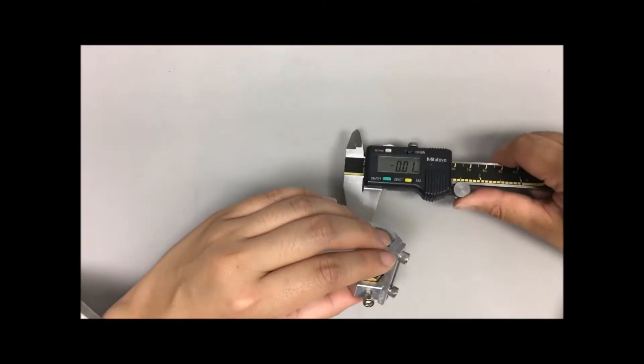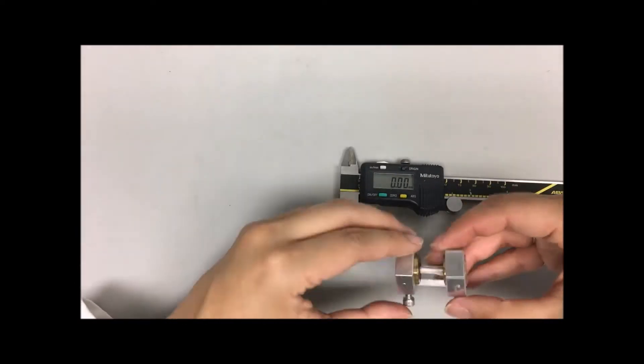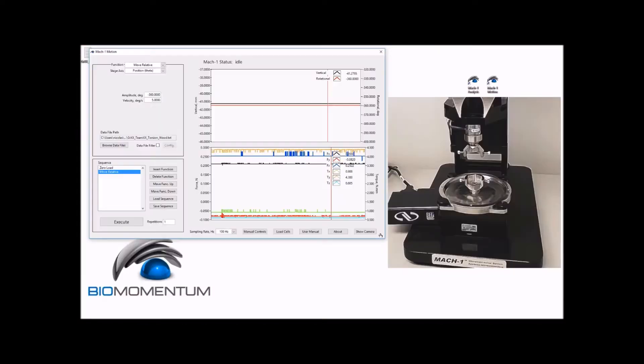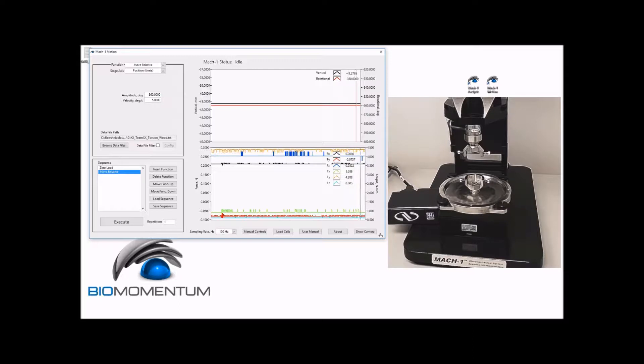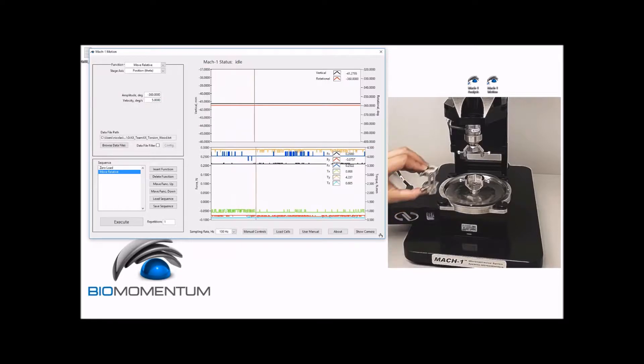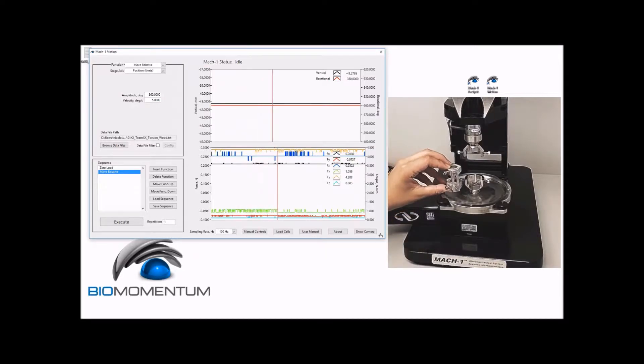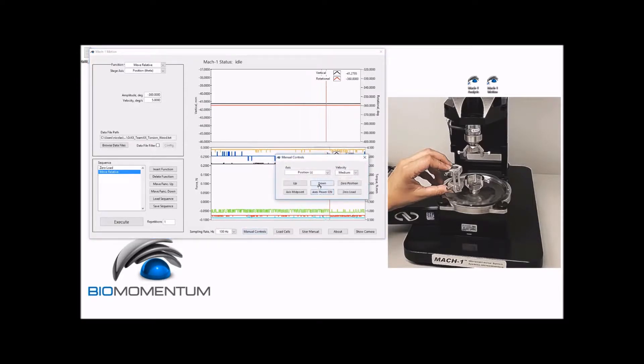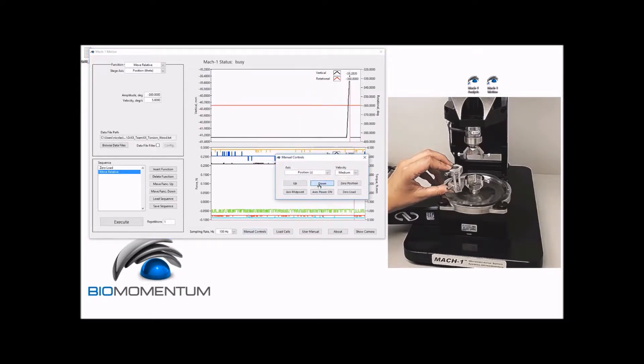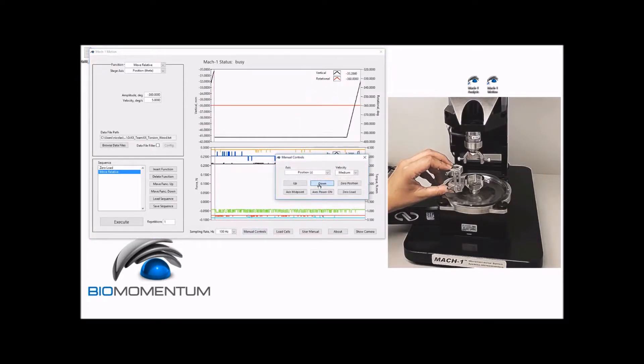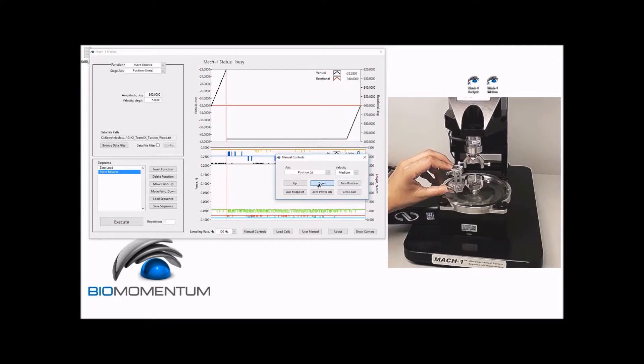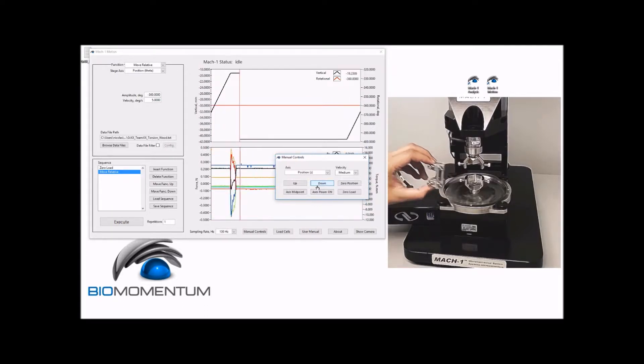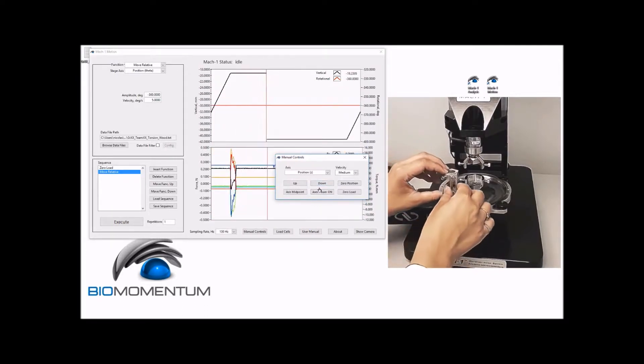Now bring the bone sample mounted in the torsion adapters to the mechanical tester. To be able to insert the mounted sample in the torsion bases, position the mounted sample next to the bottom torsion base and, using the manual controls, lower the vertical stage at medium speed so that it overlaps with the upper torsion adapter.